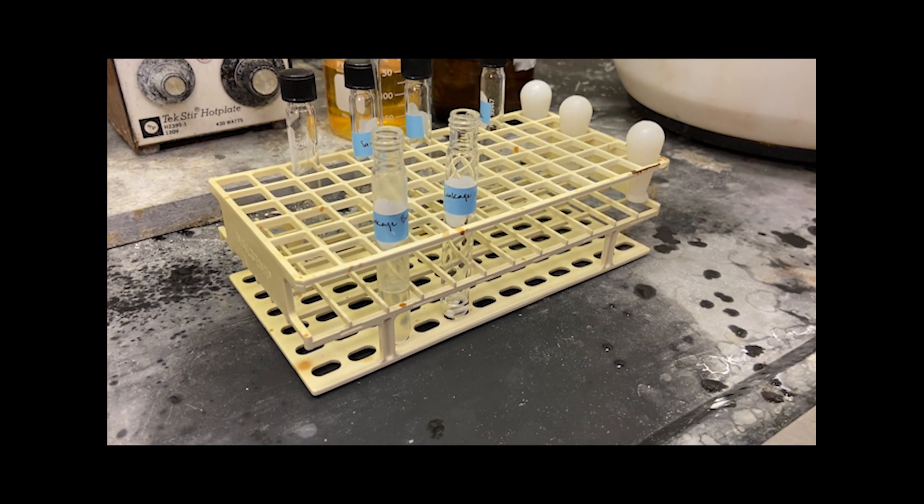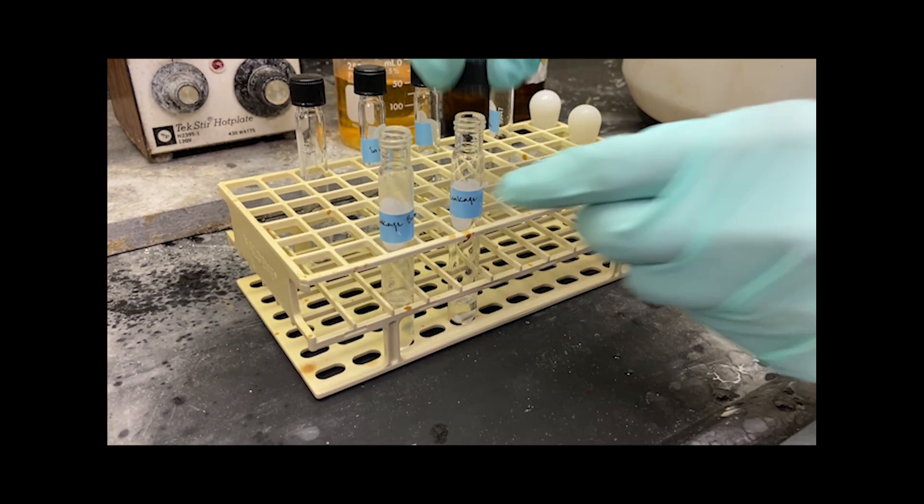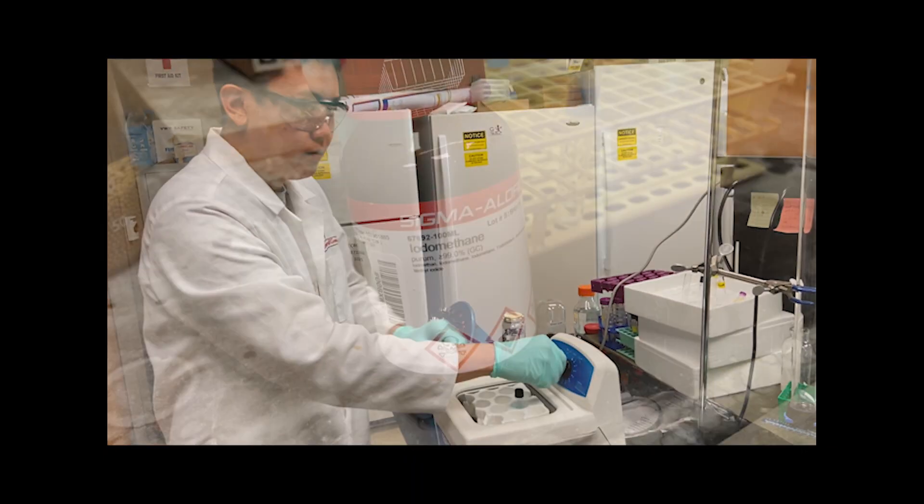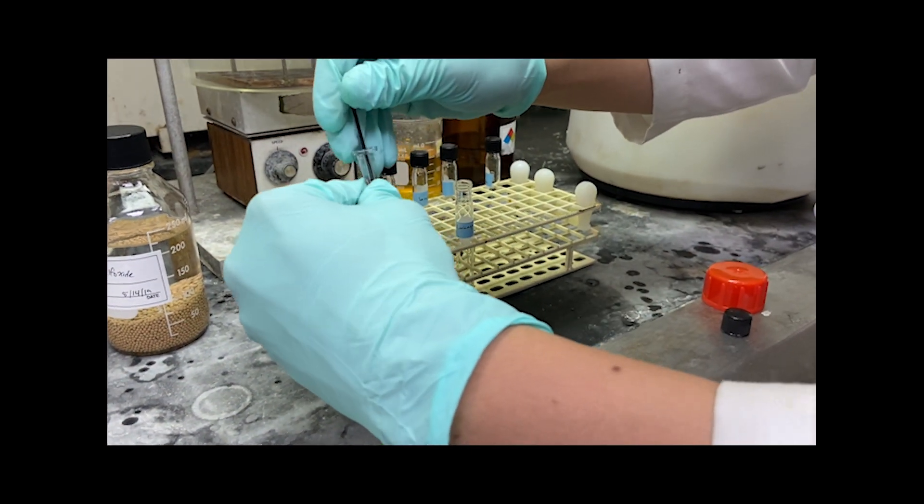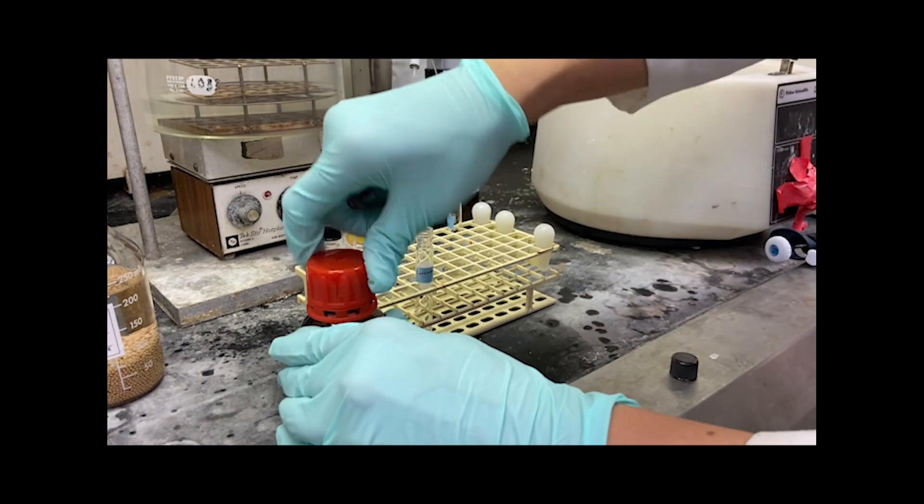We add 400 microliters of our base into our sample and sonicate the sample for 15 to 30 minutes. The sonication is to help insolubles, and magnetically spinning is okay. After sonicating, we add 100 microliters of iodomethane to the sample and allow the sample to spin magnetically for 40 minutes. This concludes one round of methylation.